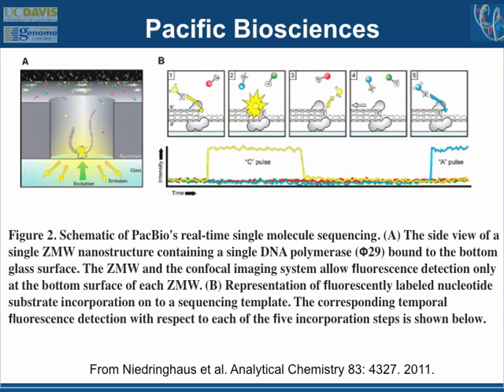And if you can jam a long enough piece of DNA into this well attached to the polymerase, in theory, this method could read 100,000 base pair pieces of DNA. Right now, people are using it to read anywhere up to maybe 5,000 base pair pieces of DNA. You can get it to work for maybe 10,000. I don't know anybody who's gotten it to really work well for longer pieces.